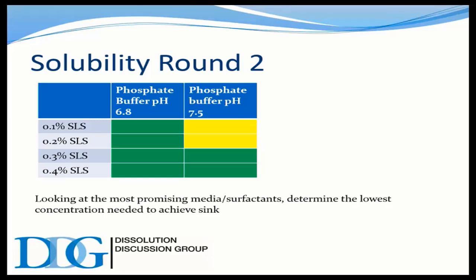Three different pKa values? I mean, that wouldn't be very typical, right? I would think it'd be fairly atypical. Ken, do you have much experience with that? Not too much, no. If you have 3 pKa in one chemical entity, let's say within ±1, I bet there'd be overlap.